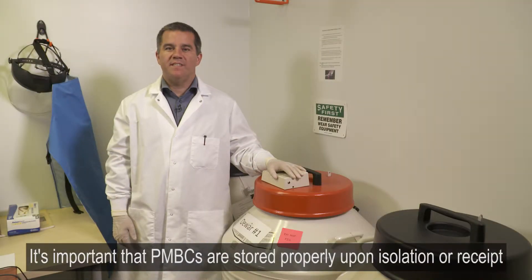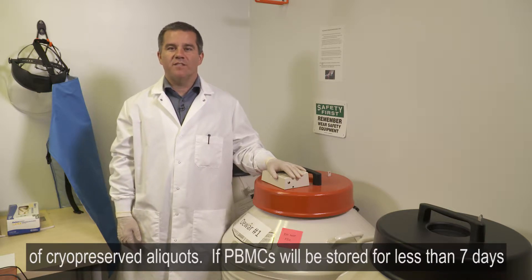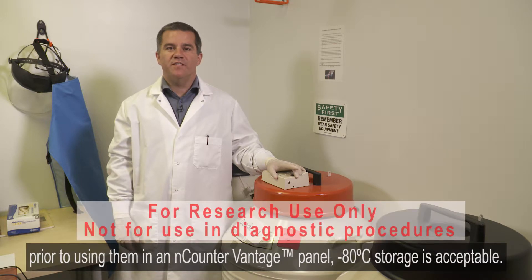It's important that PBMCs are stored properly upon isolation or receipt of cryopreserved aliquots. If PBMCs will be stored for less than seven days prior to using them in an nCounter Vantage assay, minus 80 degrees Celsius storage is acceptable.